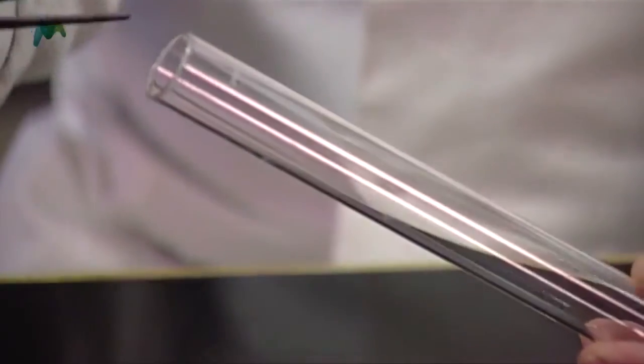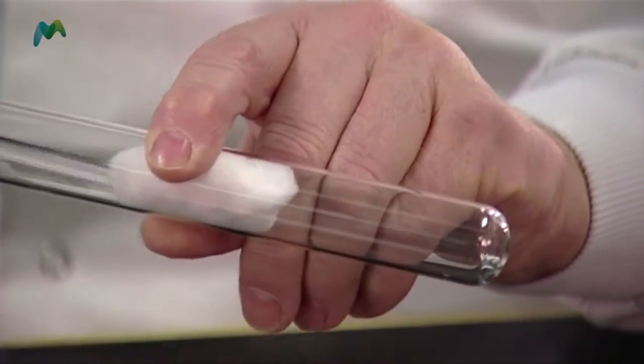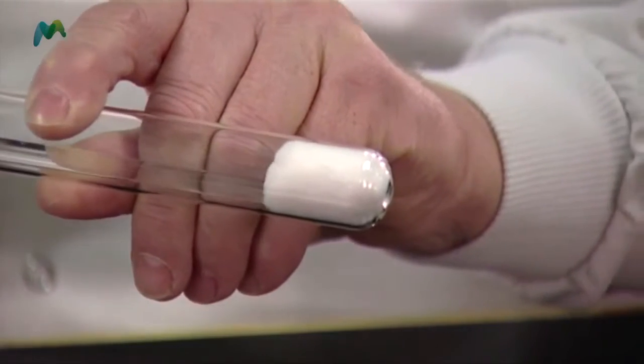But if we just drop the forceps in, it may break the bottom of the boiling tube. So what I do is I take a little bit of non-absorbent cotton wool, push it into the end, and use this glass rod — as I push it down, the piece of cotton wool slowly rotates down to the bottom of the boiling tube.